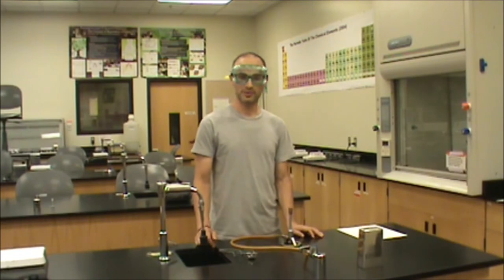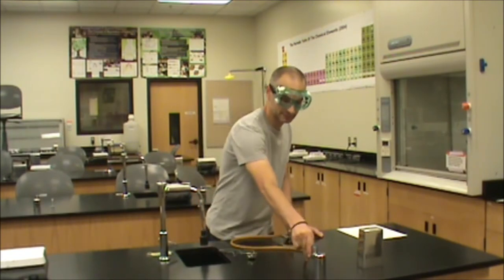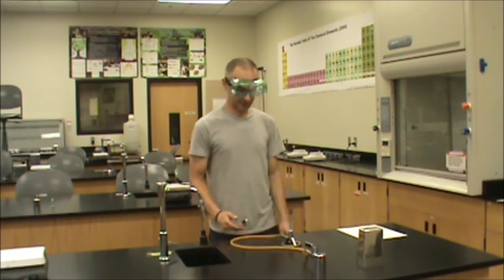When you're ready to ignite the Bunsen burner, you turn on the gas, step back, and use the striker to ignite it.